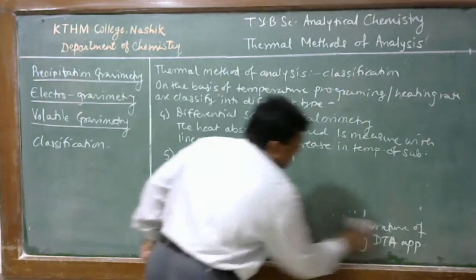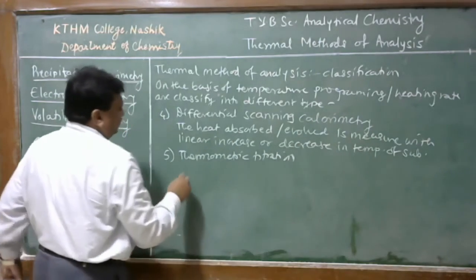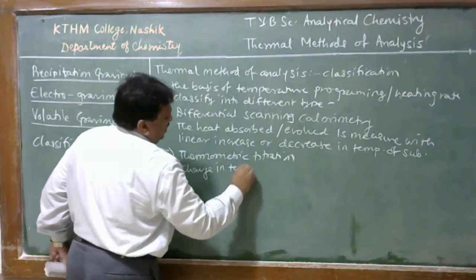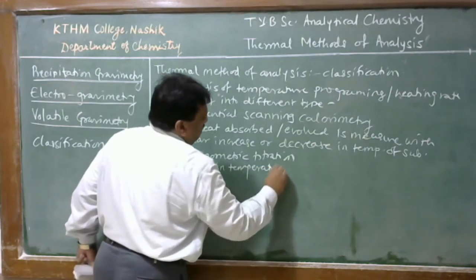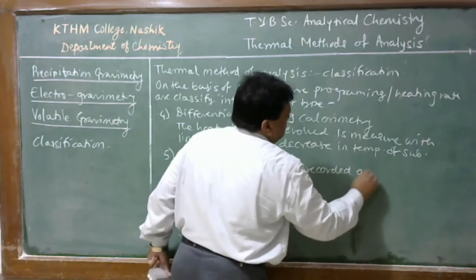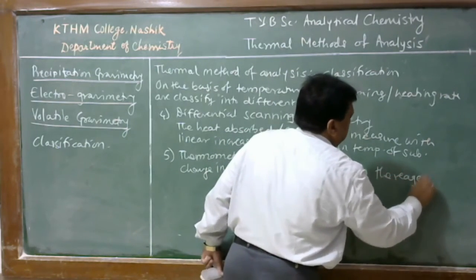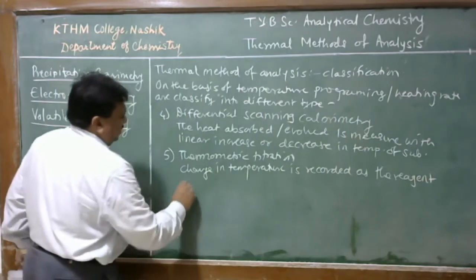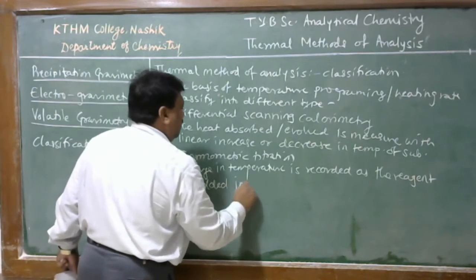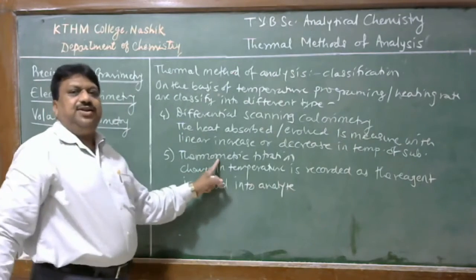Here, change in temperature is recorded as a function of reagent added into the analyte.